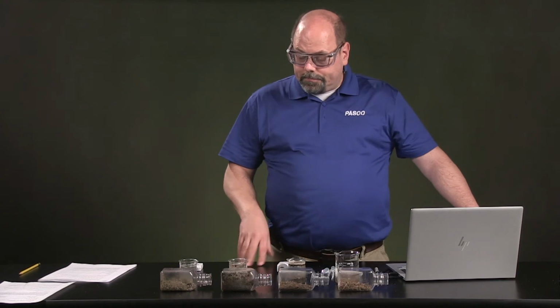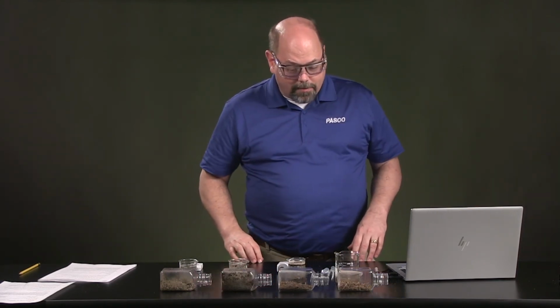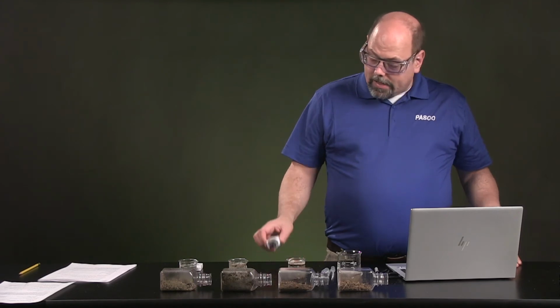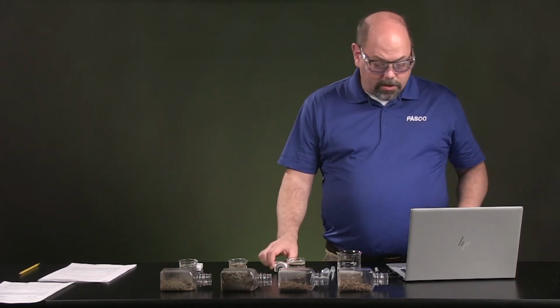But that sand should help you to determine in the soil triangle which of these types of soils we're talking about. You can look up on those just from your observations. The next is when we went in to take a look at the carbon dioxide, or the sort of living biota, the examples of what's going on.